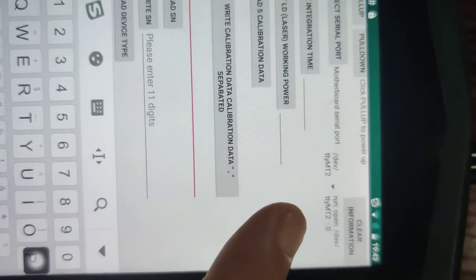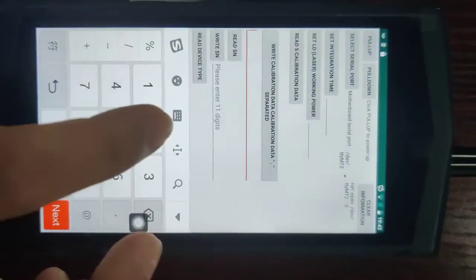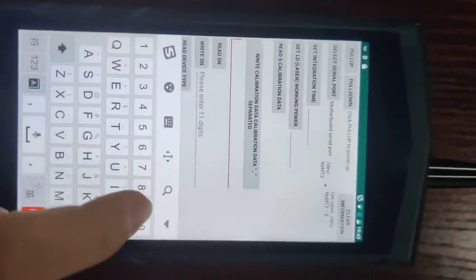This means the select is a success, and then you have to keep in the pixel numbers you have just reset here.